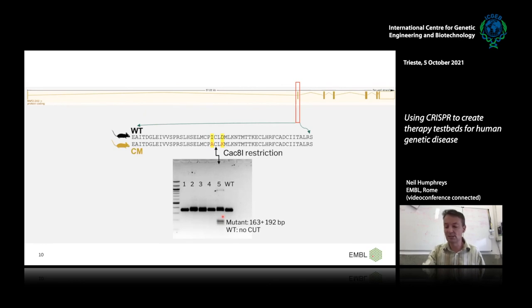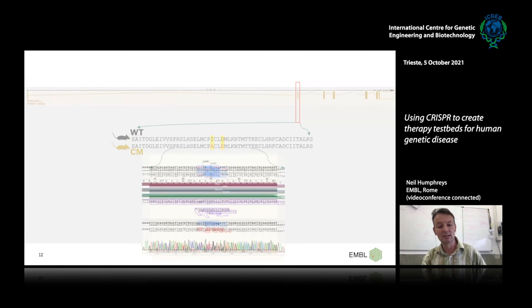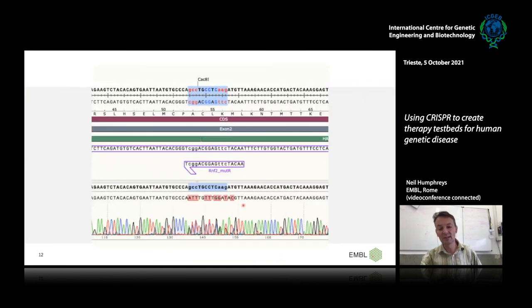And at that stage, it's just a candidate. We would then want to sequence across that allele. And if it's worked perfectly, what we're really looking for is wild type read upstream and wild type read downstream. This is a mixed sequence read, because all we're doing is sending off the PCR product across that allele for sequencing. And typically you will have either the wild type allele there and the mutant allele in the more simple cases. Sometimes you have multiple alleles and therefore the reading of this plot is more difficult.